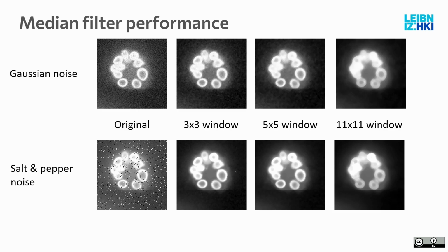So this is nice. And you see an interesting effect with higher window sizes: instead of making everything blurry, so I still cannot distinguish the cells that easily anymore, the contours are still sharp. That's just how the median filter works. It rather extends the bright parts, makes them larger, but it usually keeps the contours very sharp. That's why it's often used. Sometimes the box filter is also useful. It really depends on what you want.